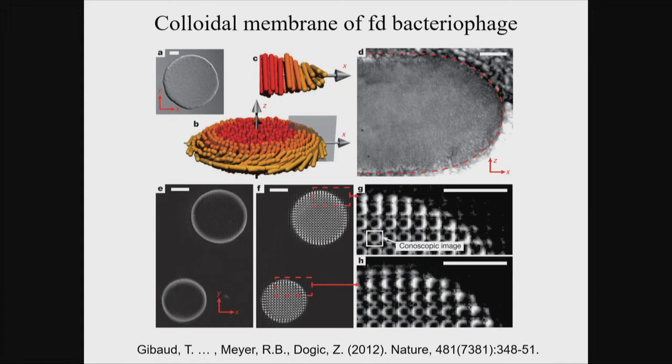That's the graduate student who founded the company Lytro, which implemented this technique in a regular handheld camera. And so we'd like to move this also to 3D viewing, reconstructing 3D objects, including their polarization anisotropy, their birefringence axis, not only in the plane perpendicular to a single viewing direction, but also how much it is tilted.